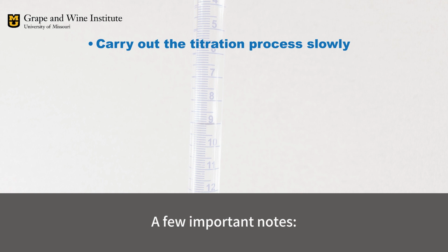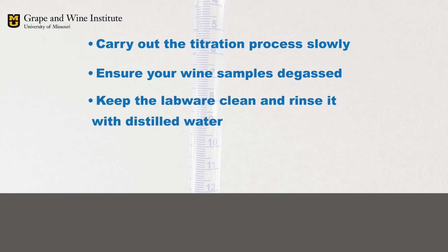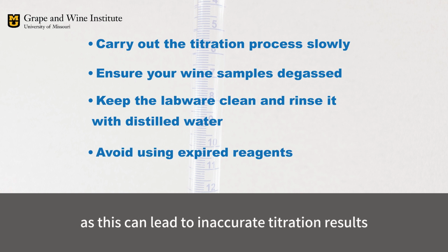A few important notes. Carry out the titration process slowly. Ensure your wine samples have been properly degassed before taking the test sample. Keep the labware clean and rinse it with distilled water. Avoid using expired reagents, as this can lead to inaccurate titration results.